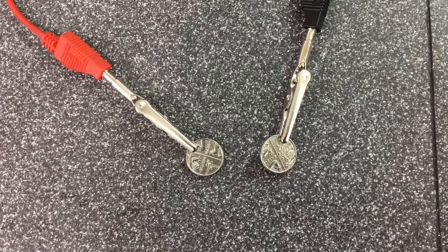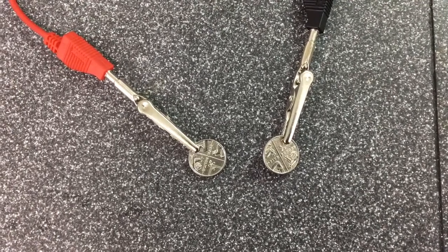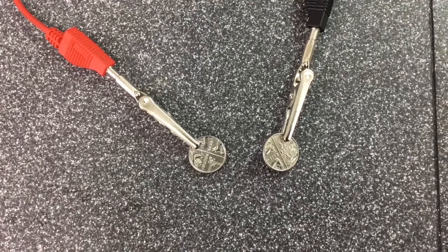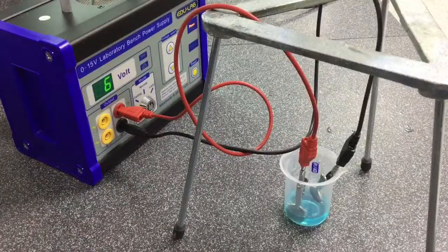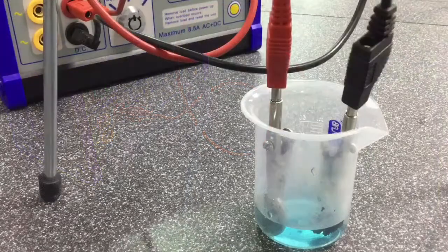Electrolysis is also utilised for a process called electroplating, in which a fine coating of an additional metal can be placed on the outside surface of another. In this process the inert graphite electrodes are replaced with different metals, in this case two 5 pence pieces.